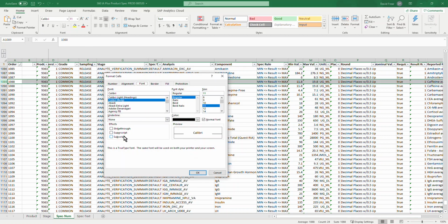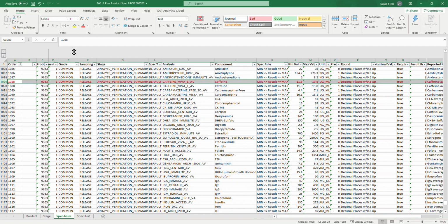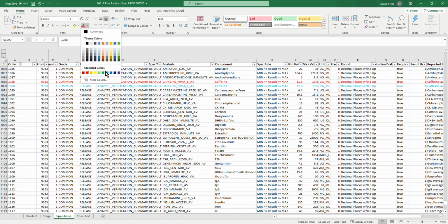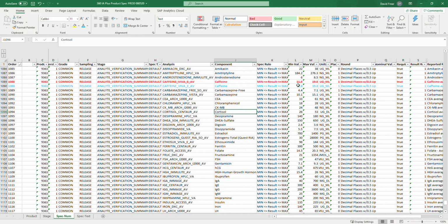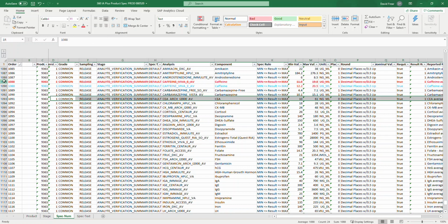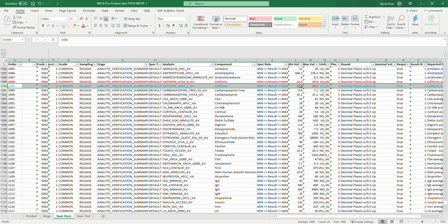what I would do, is do a strike through on that one and make it red. And then this is our new one, so we can make that one red as well, but not strike it out. Or we could leave it, maybe a different color would be more appropriate. Make it blue, and then say we're going to change our specs to 12.2 to 20.5. We can make those red to make sure that people know that that's what happened, because that's the main change. So this one's being removed, this one's being added, and this is what changed.